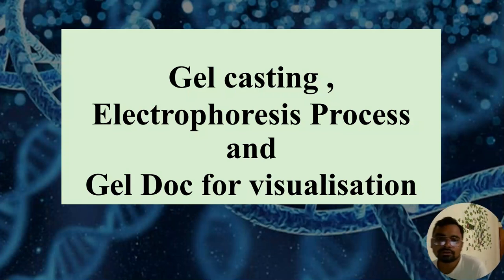Hi everyone. Today we are discussing gel casting and how to set the conditions for gel electrophoresis, which mechanism is working during gel electrophoresis, and how to run the gel. We will also see why we get band intensity and different types of bands of DNA with their mass variation and length variation using the gel. So in this lecture, we are discussing all these things.